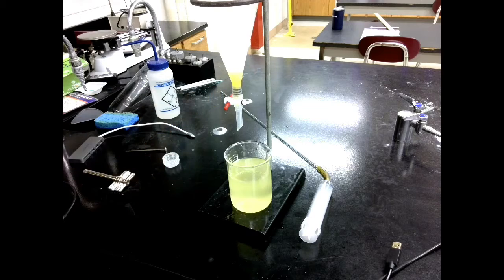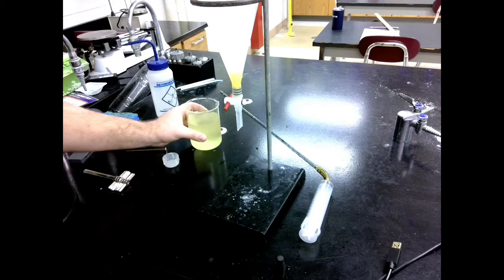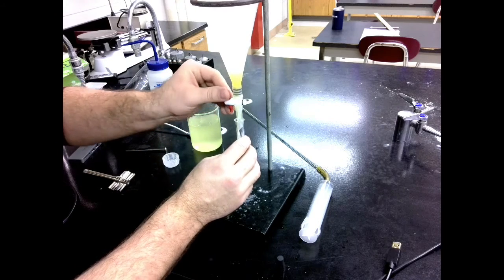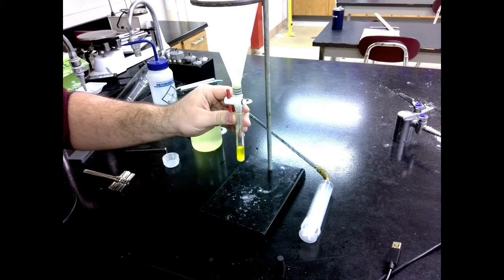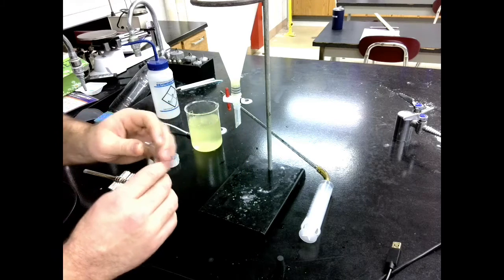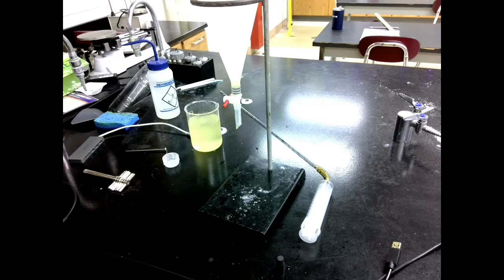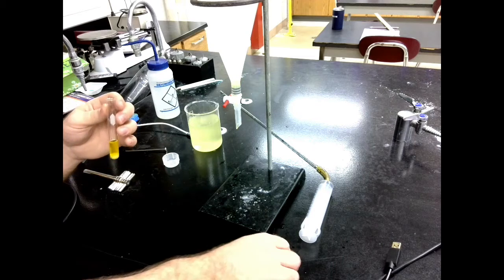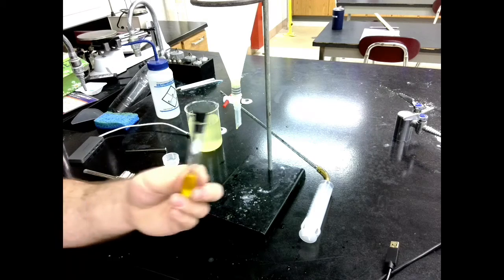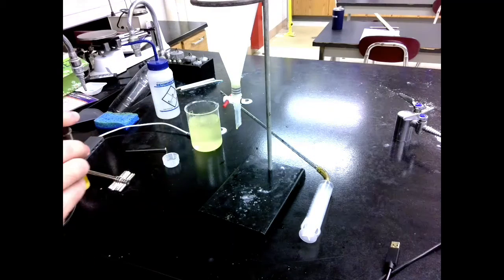Okay, I've got my entire bottom layer of water drained out. I know because I'm starting to get just a little bit of oil coming out. And so I'm going to set that aside. I'm going to take a small test tube, I'm going to set it up right under the stopcock, and I'm going to let the oil drain right into that. And there we have just a little bit of orange oil. Put a stopper in that. Using some masking tape, put your name on it and set it in a test tube holder.